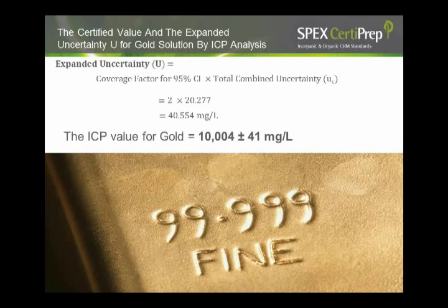So what do we have now for overall uncertainty for CRM? Pipette uncertainty, where relative uncertainty is calculated to be 0.008938. Flask uncertainty, the relative uncertainty is calculated to be 0.003987. And the total uncertainty is given here. This is the value we are going to use later in pooling the overall uncertainty for the method.